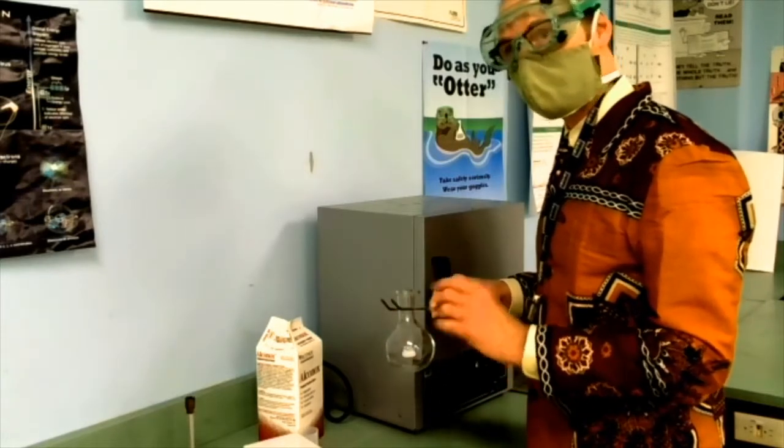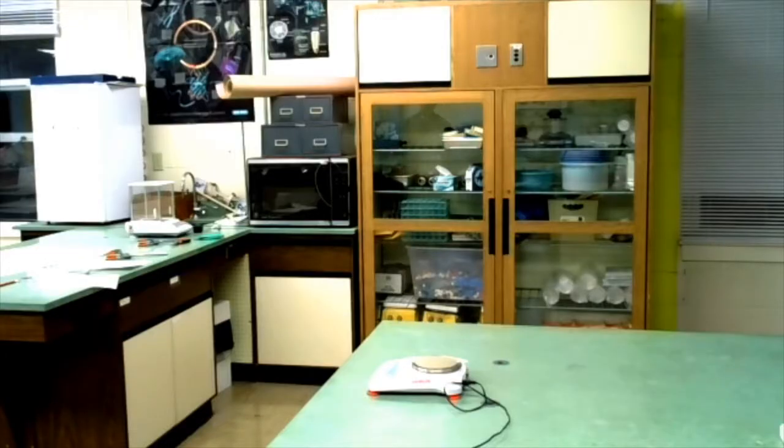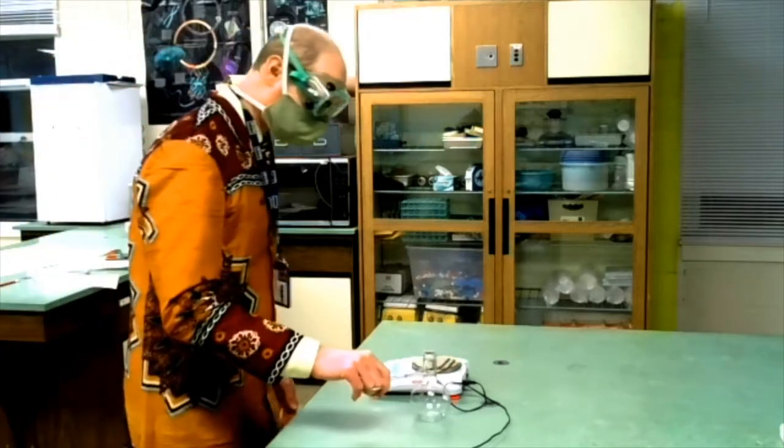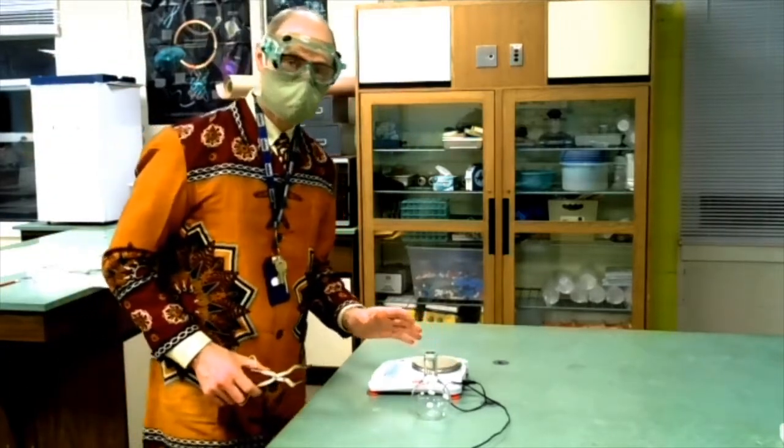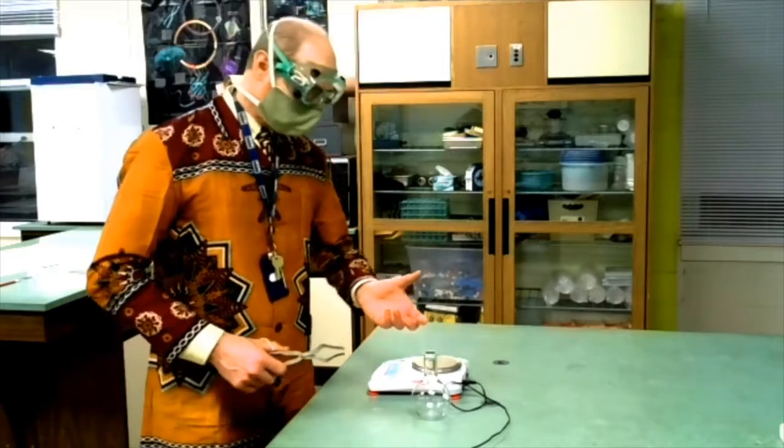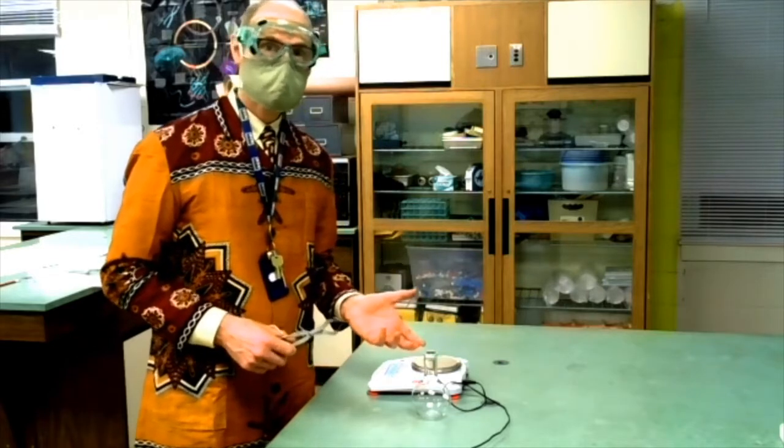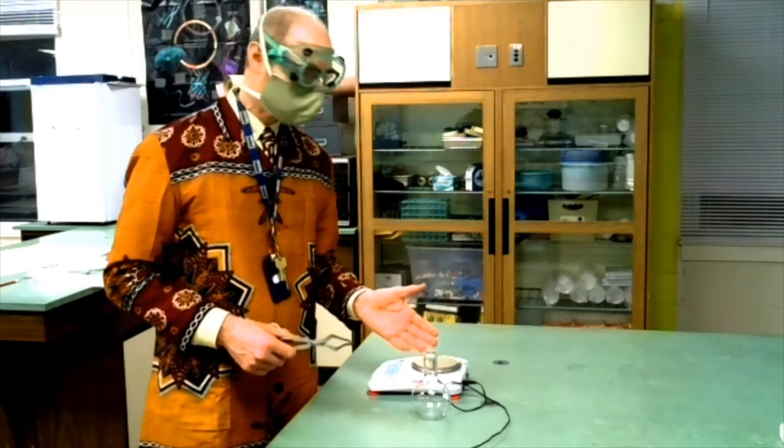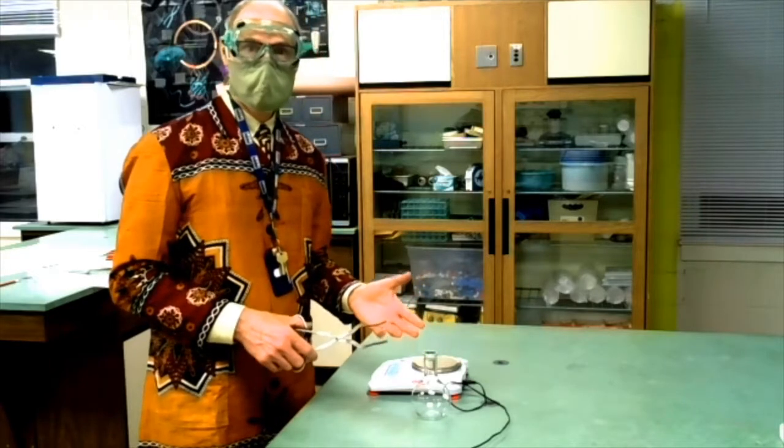Now I'm going to let the flask cool down to room temperature. This is necessary for correcting the mass of the air, because in our calculations we're going to have to subtract the mass of the air from the mass of the assembly, and that's only going to work if we have the right temperature.